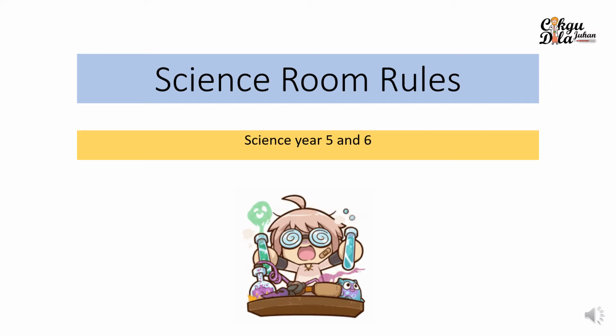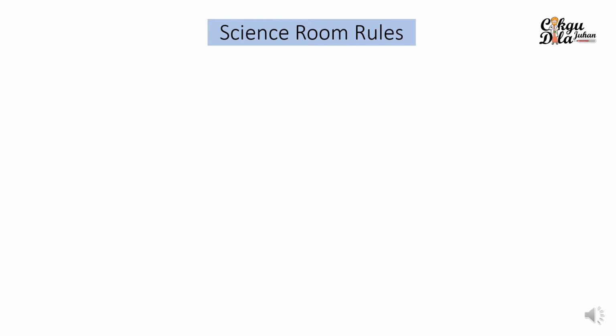Okay, let's go to the science room rules. These rules apply before you enter the science room, during your experiment in the science room, and after or before you leave the science room. So what should you do?